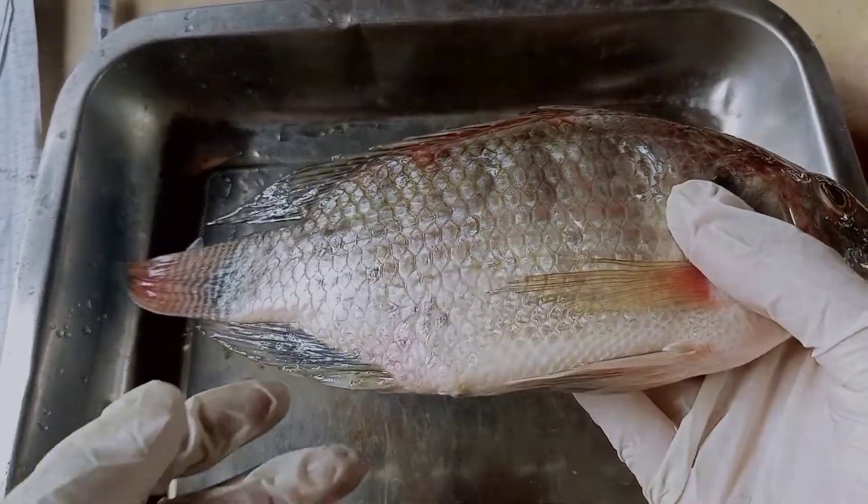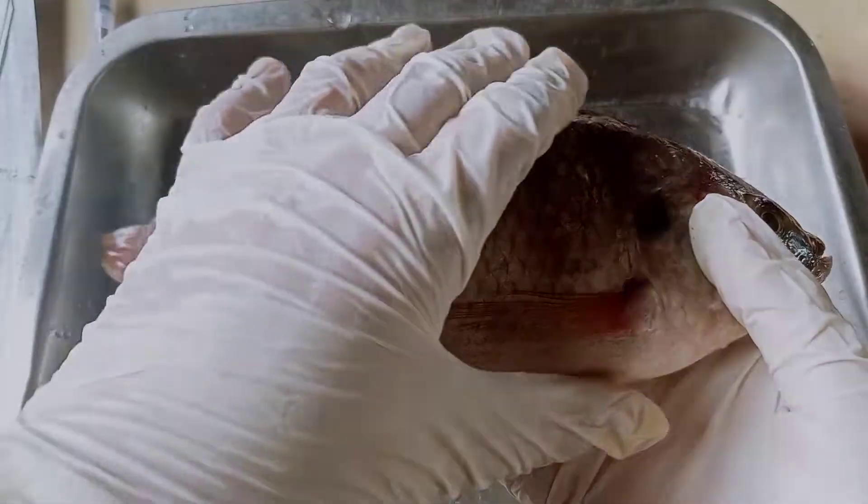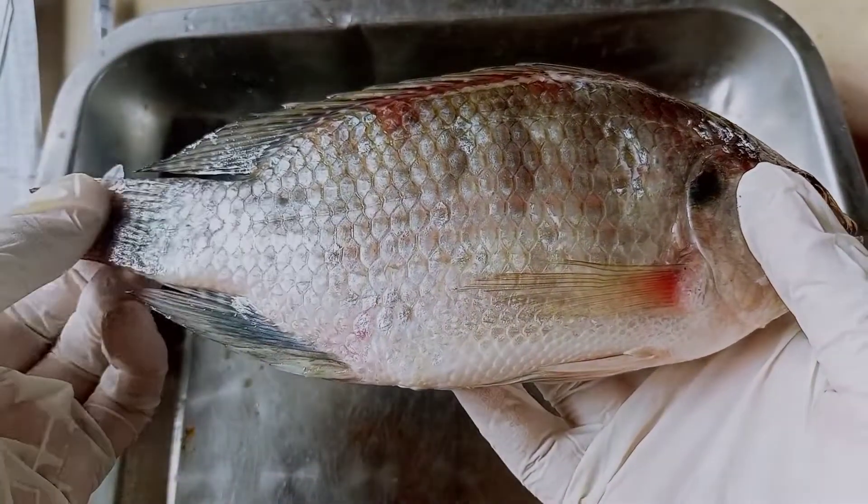Tilapia is divided into three regions: the head, the trunk, and the tail.